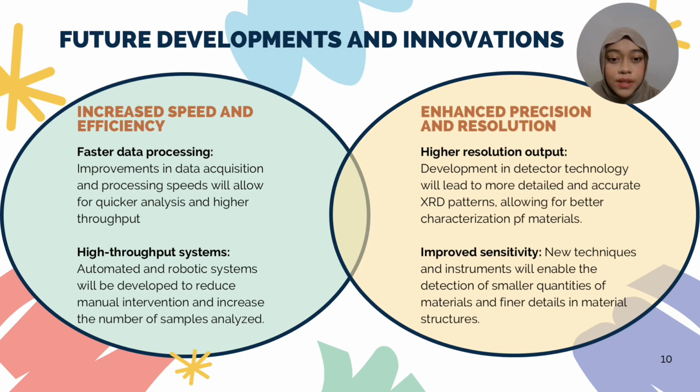Second, enhanced precision and resolution. Higher resolution output from development in detector technology will lead to more detailed and accurate XRD patterns, allowing for better characterization of materials. And improved sensitivity, new techniques and instruments will enable the detection of smaller quantities of materials and finer details in material structures.